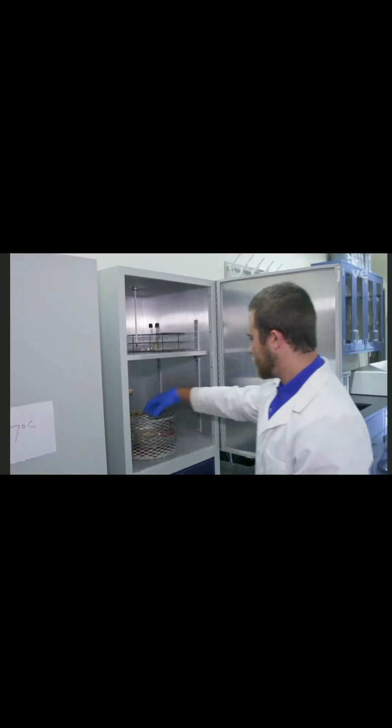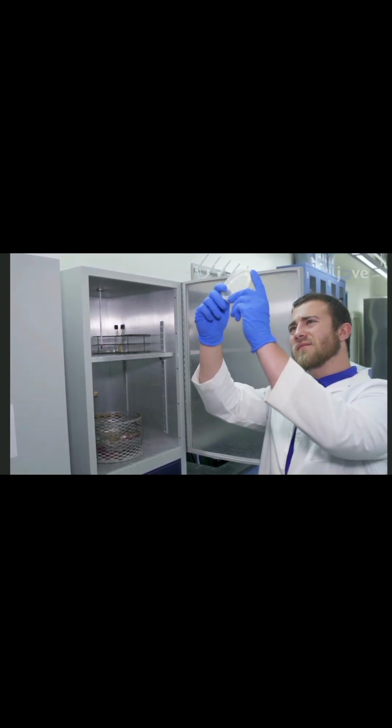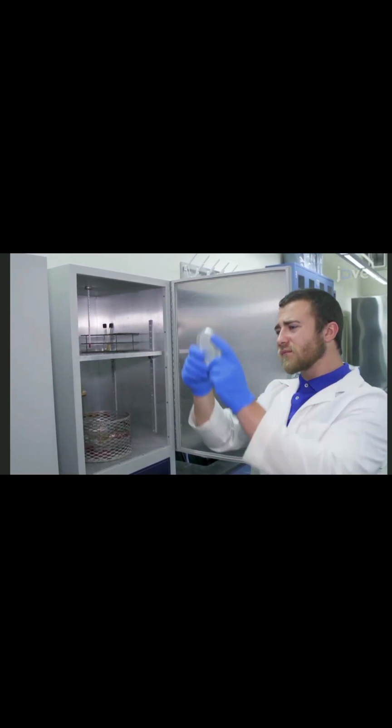Going forward, check the plates every 24 to 48 hours to give the colonies time to grow and metabolize any indicator reactants.